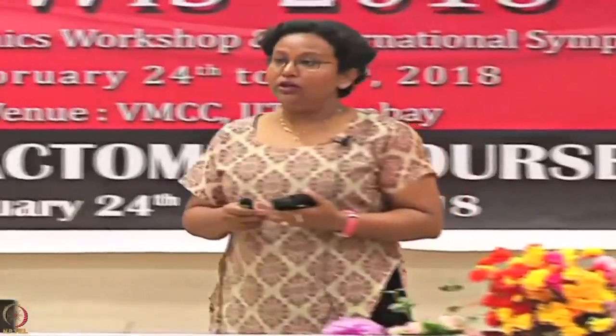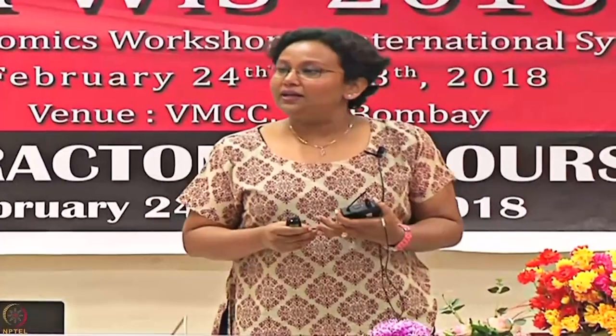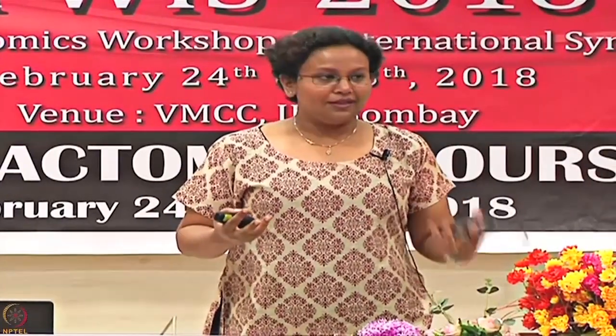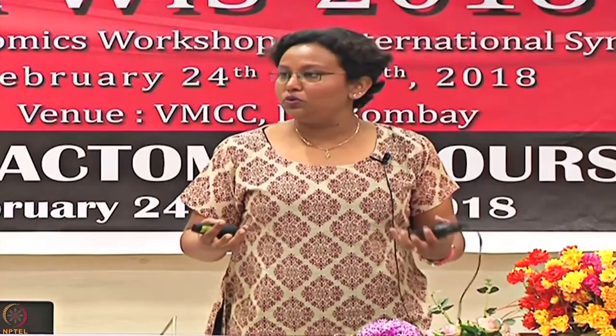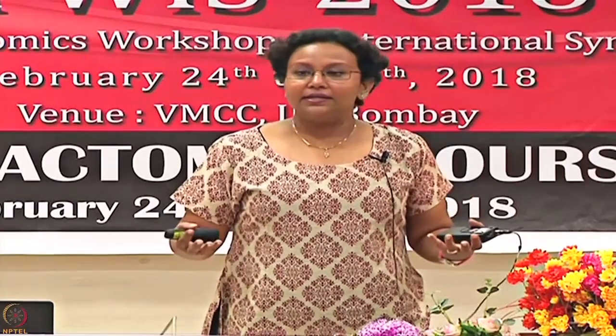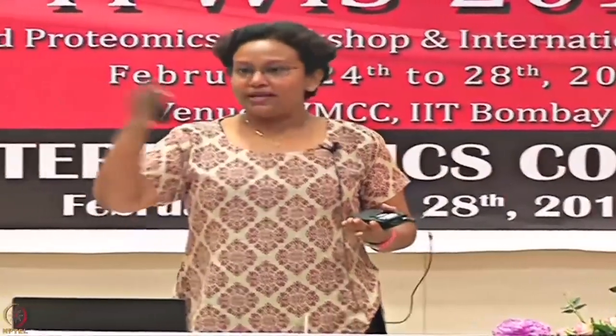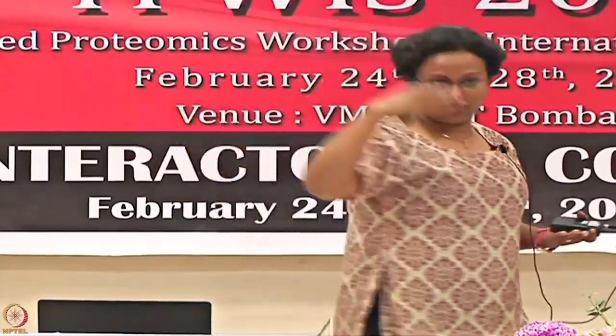So the first thing that you would like to look at is actually the molecular weight of the interactant. Which one would you think should go as a ligand? If you have two interactants and one of them is large and one of them is small, which one would you like to go as a ligand? The small one, absolutely, because you can use the larger one as an analyte, so you get a higher response.